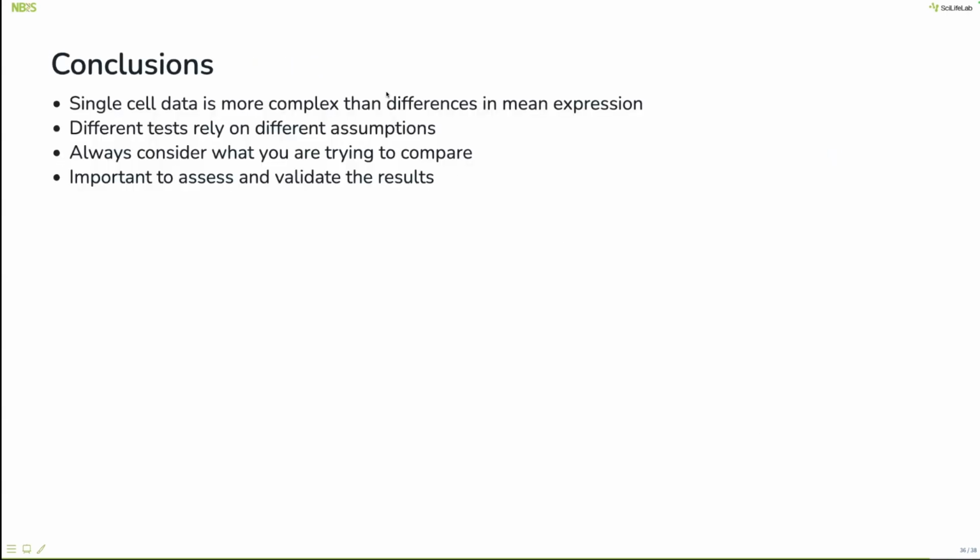Yes. So if we have a condition where we have multiple treatments done at one time, in one particular cell type, and then a knockout of this cell type with the same set of treatments done at a later time point. In that case, we have a mix of batch effect here because the preparation is not done at the same time. And then we have complex designs. In each experiment, we have like 5 or 6 different treatments. So in that particular case, what would be the ideal test to do?